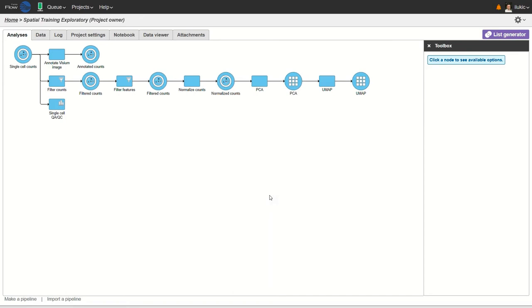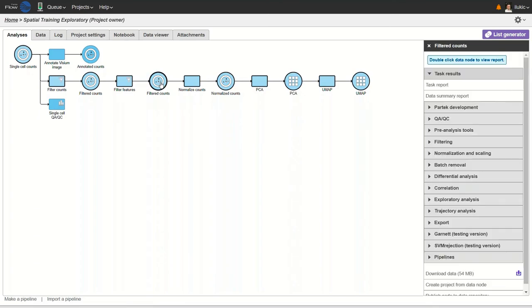I won't jump straight into batch correction, but first we are going to consider one step upstream. That's data normalization. So let's just for a second consider normalization. As you know, data normalization is really critical because it has profound impact on any downstream steps. So why don't we compare the CPM transformation, the procedure that I used already, with an alternative normalization.